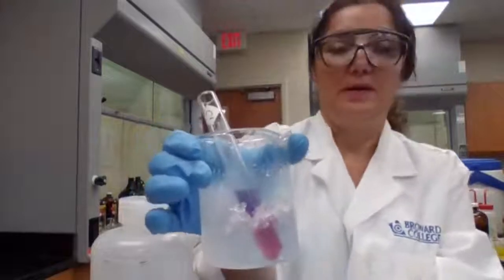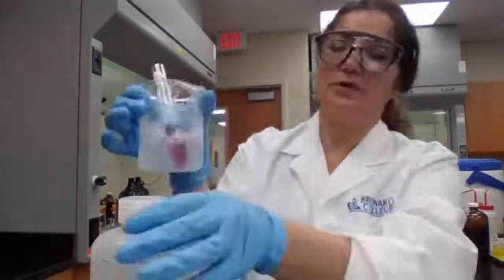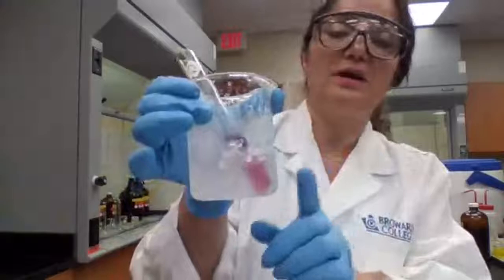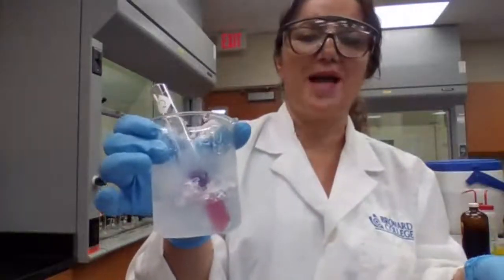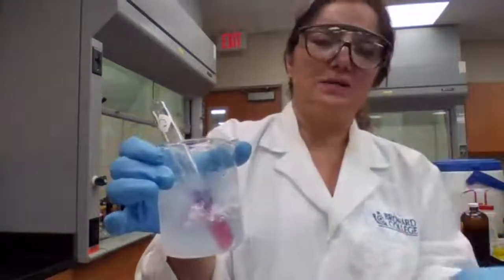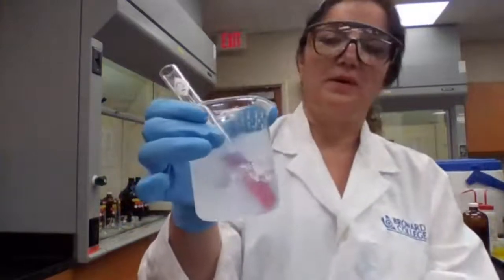And if it stays in the ice bath long enough, everything is going to be changing color. When I was talking about exothermic, endothermic, like you lower the temperature, it changes to one side. You increase the temperature, it changes to the other side. From the color of the reactant and looking at the balanced equations that you have, because it gives you the colors, you say if it's shifting to the right or to the left, and you can decide if this reaction is an exothermic or endothermic type reaction.